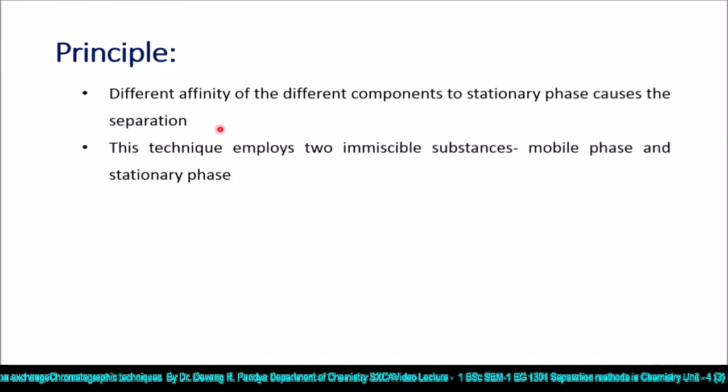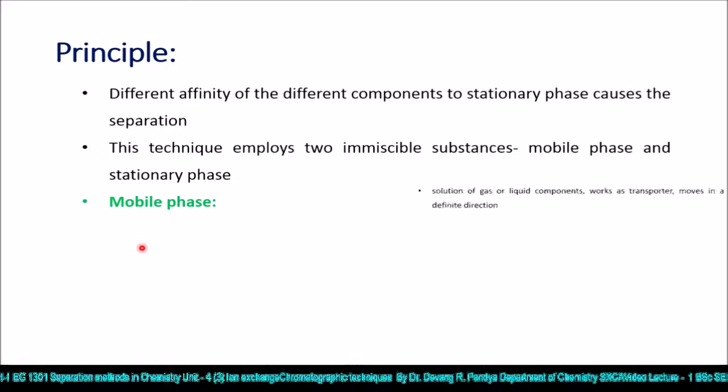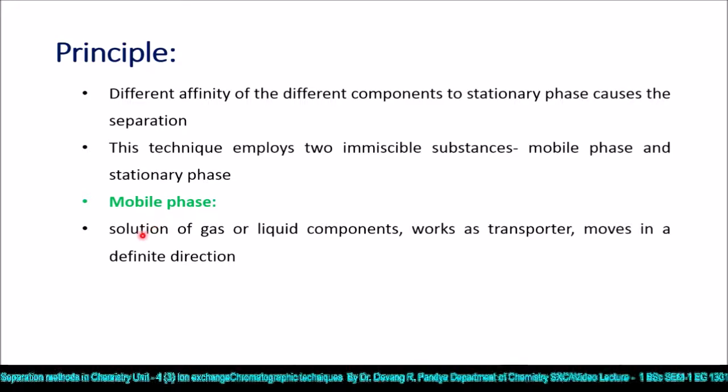This technique employs two immiscible substances, the mobile phase and the stationary phase. These two phases must be immiscible, made of substances which must be immiscible with each other. Mobile phase: the solution of gas or liquid components works as a transporter and moves in a definite direction.